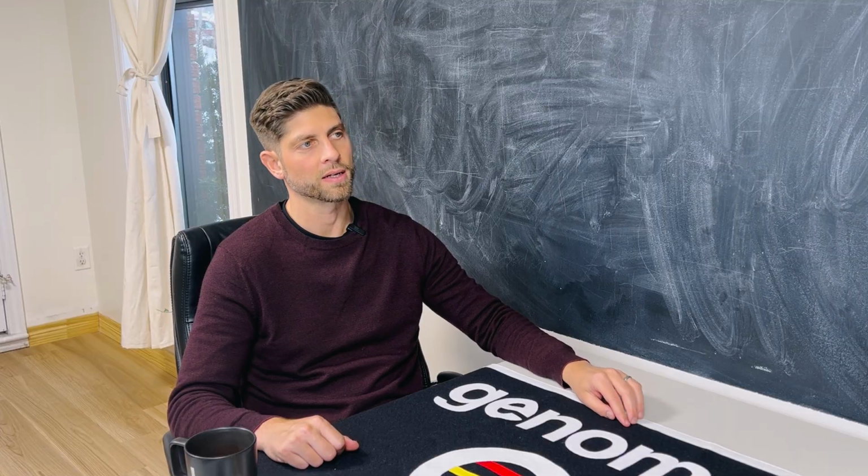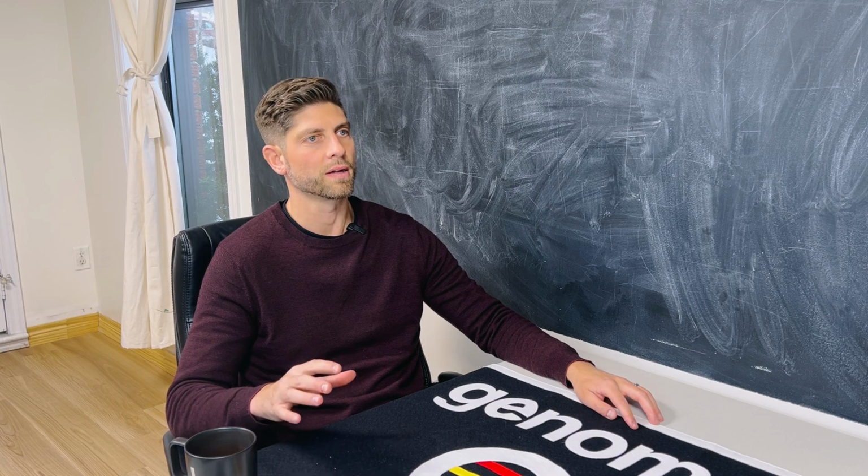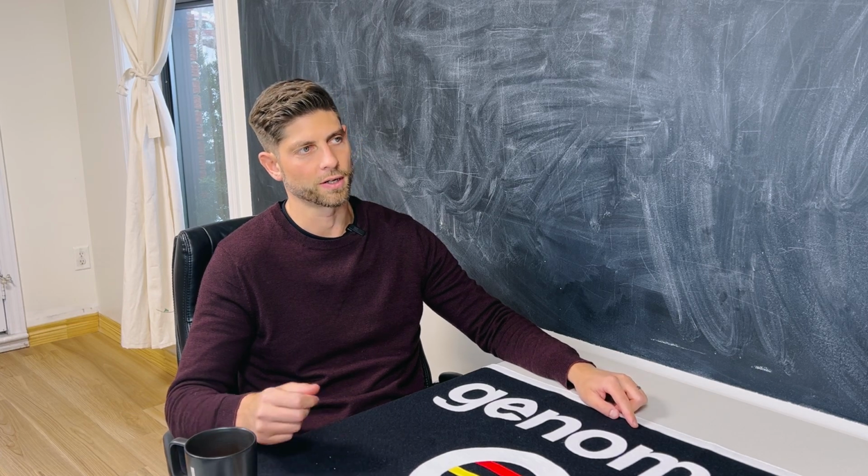Yeah, I've heard pentane is kind of the optimal secondary solvent for growing large diamonds. We've heard that as the most common one. It's convenient and relatively easy to get rid of. It boils at around 30 degrees Celsius, so it's pretty convenient to use. And that's covered by Murphy in our controlled crystallization course. Yeah, we do that course, absolutely.